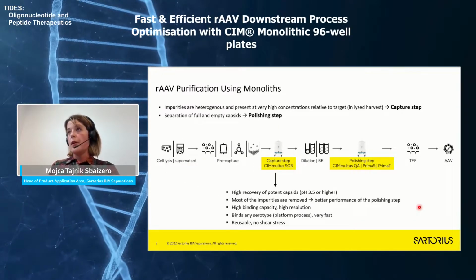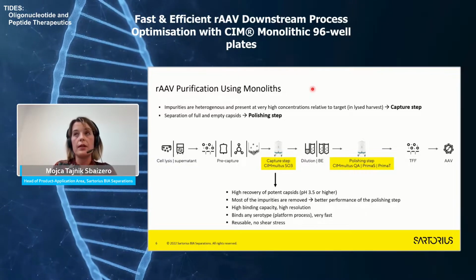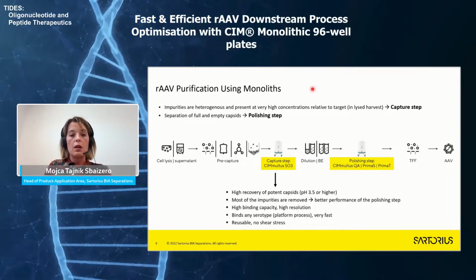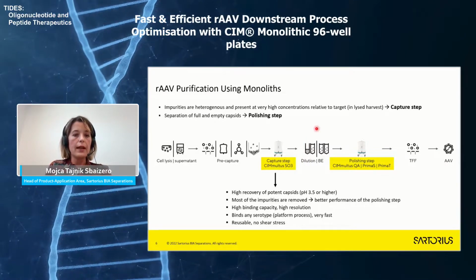So today we will talk more about purification using monoliths of recombinant adeno-associated viruses, shortly called AAVs. In our company, we developed a platform process for AAV purification.